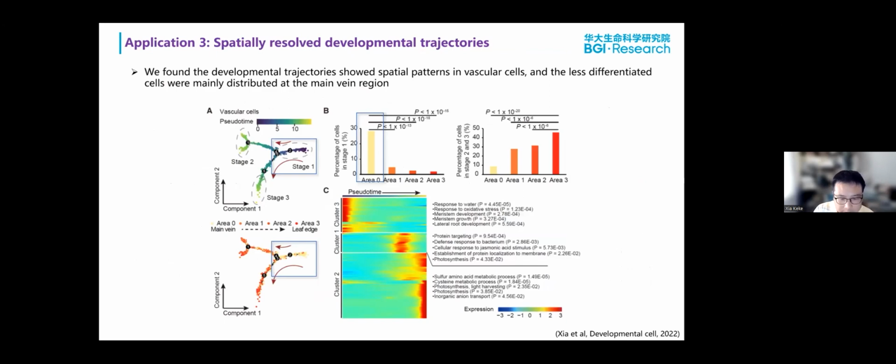Thirdly, we reconstructed the spatially resolved developmental trajectories of vascular cells. We performed pseudotime analysis on vascular cells and compared the developmental stages in the 4 areas.